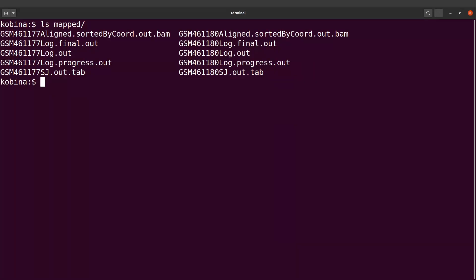We are now going to count the number of reads that were assigned to each gene. In other words, we are going to perform gene quantification. We are going to use featureCounts to do this.